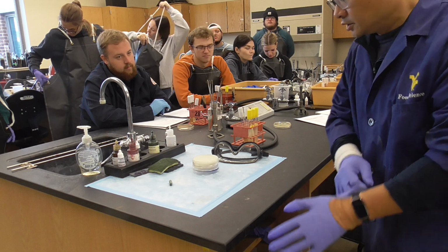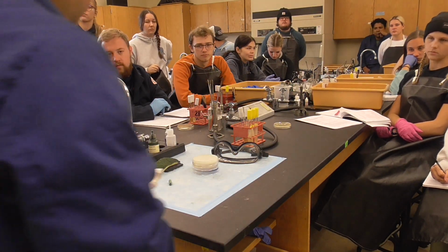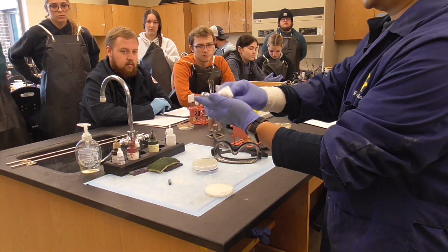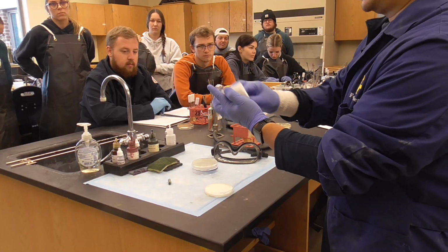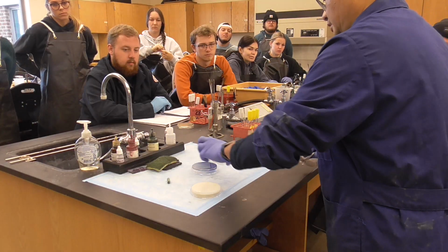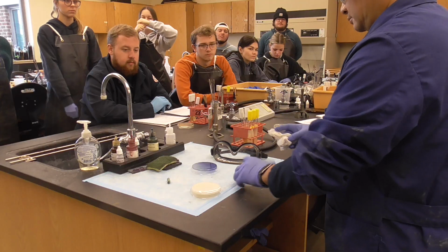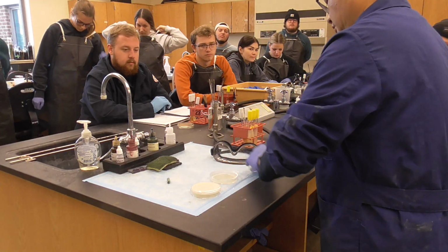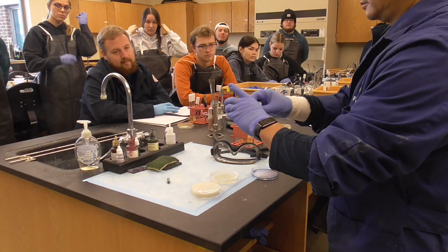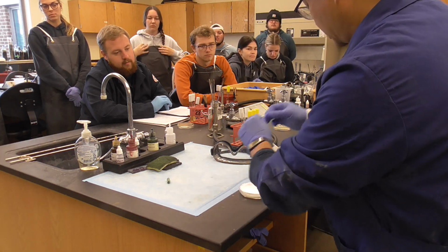Last time we did a little bit of the oxidase test. This is very wet. Look at this. So don't forget, you have to do this. I remind you all the time. Lots of people don't realize it. And this inside looks terrible. So clean it. Okay, now you can all do it at the same time.